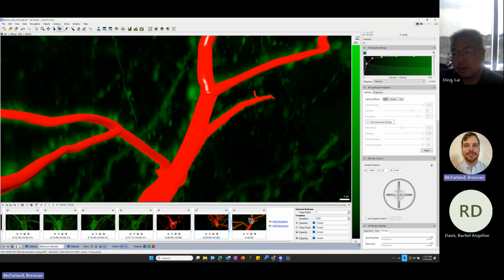That kind of covers movie making. There's a lot of flexibility with this, but it's relatively simple in terms of how you'd implement it. A lot of different options, but you're not bogged down with a million different keys and having to control all of those steps. But like you mentioned before, if you do want to just run it yourself, then you can have Windows record your screen while you manually do it yourself. That's also an option.